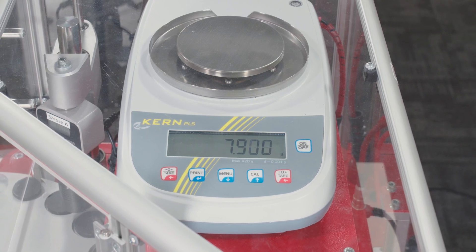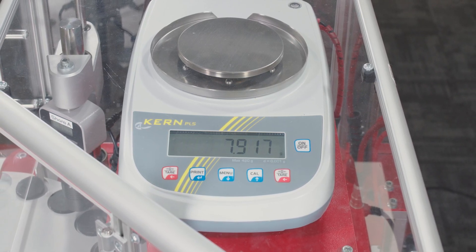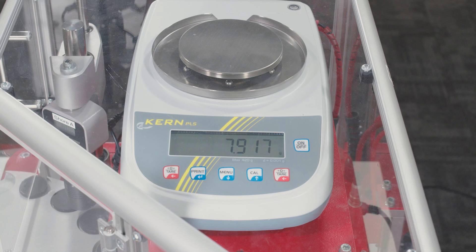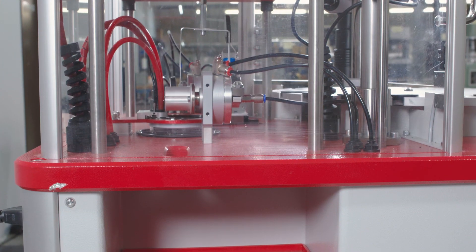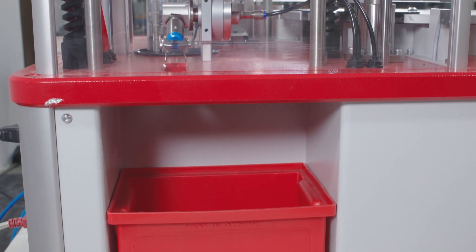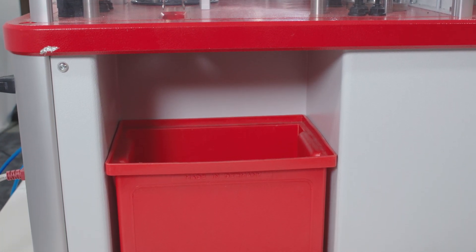A standard analytical balance with integrated calibration is used to provide the most accurate results with full traceability. After the density test, the sample is removed by an actuator and placed into a bin, where it is separated from untested samples.